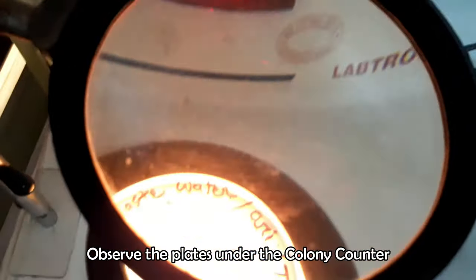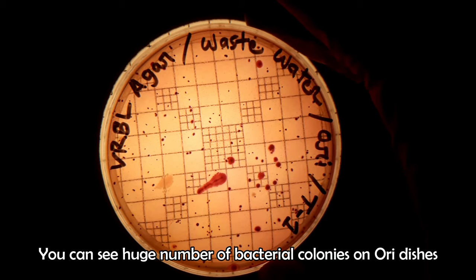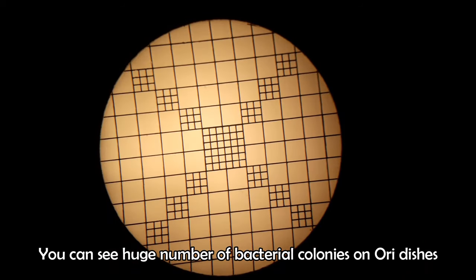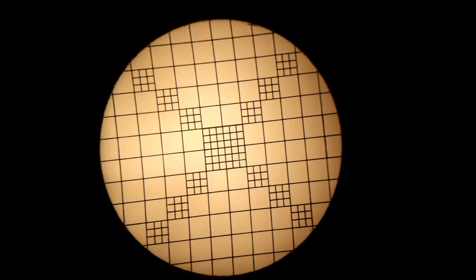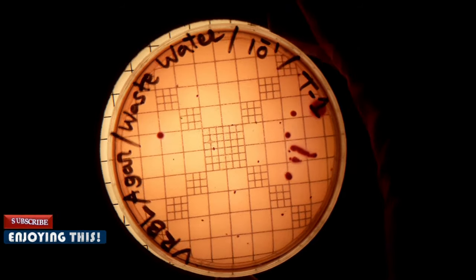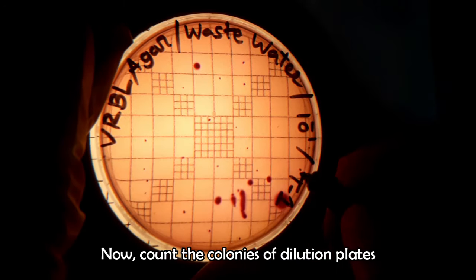We will consider the count ranging from 10 to 150 CFU. You can see a huge number of colonies on the original sample dishes, that's why we will not consider these plates. On the other hand, dilution plates contain colonies in the range of 10 to 150 CFU. Let's count the colonies.